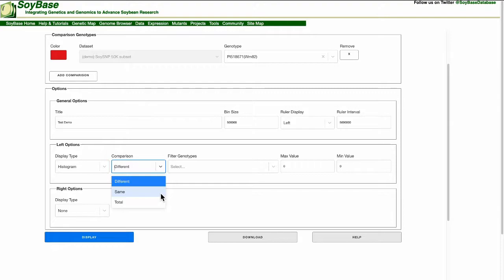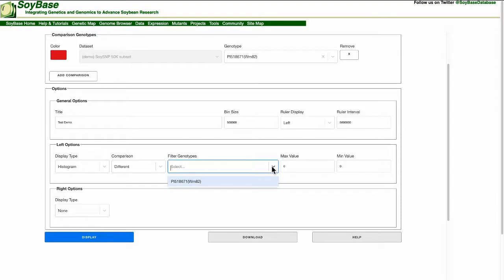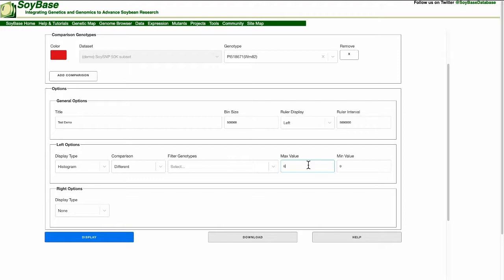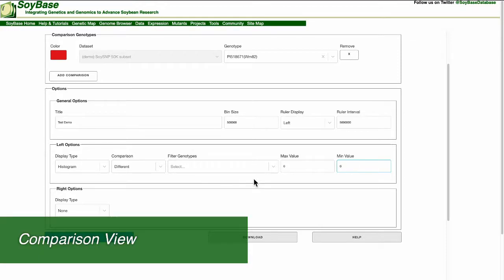The filter genotypes option will restrict only the genotypes that you select to the picture. Max is the value cutoff for displaying maximum height on the glyph. Min is the value cutoff for displaying anything. Any count smaller than this number will not be displayed. Now let's hit the display button.